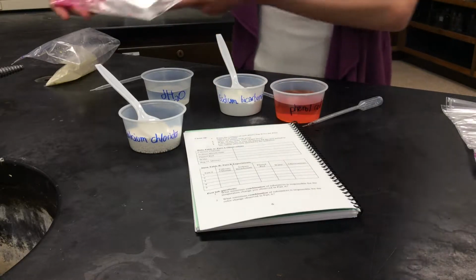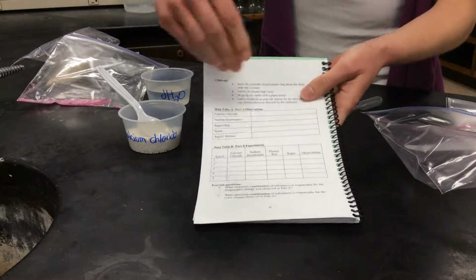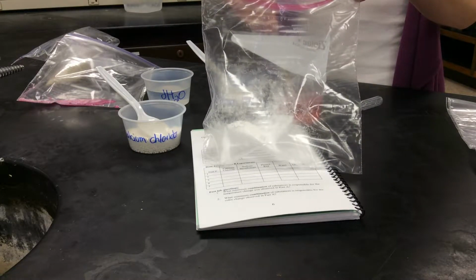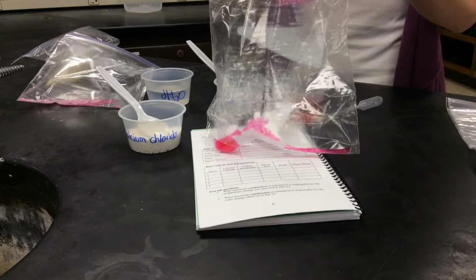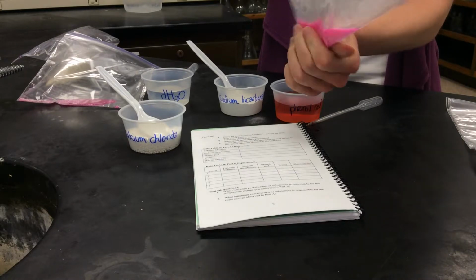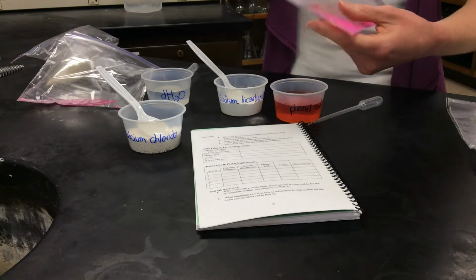Okay, now we are going to try sodium bicarbonate and phenol red. So for number 2, check sodium bicarbonate, phenol red, and water, because again, the phenol red is dissolved in water. So sodium bicarbonate, phenol red. Okay, so it's still pink. There's not much of a temperature change. If anything, it's a little cool. It's not getting warm though. Okay, so you can just write down the color. Other than that, not much is happening.